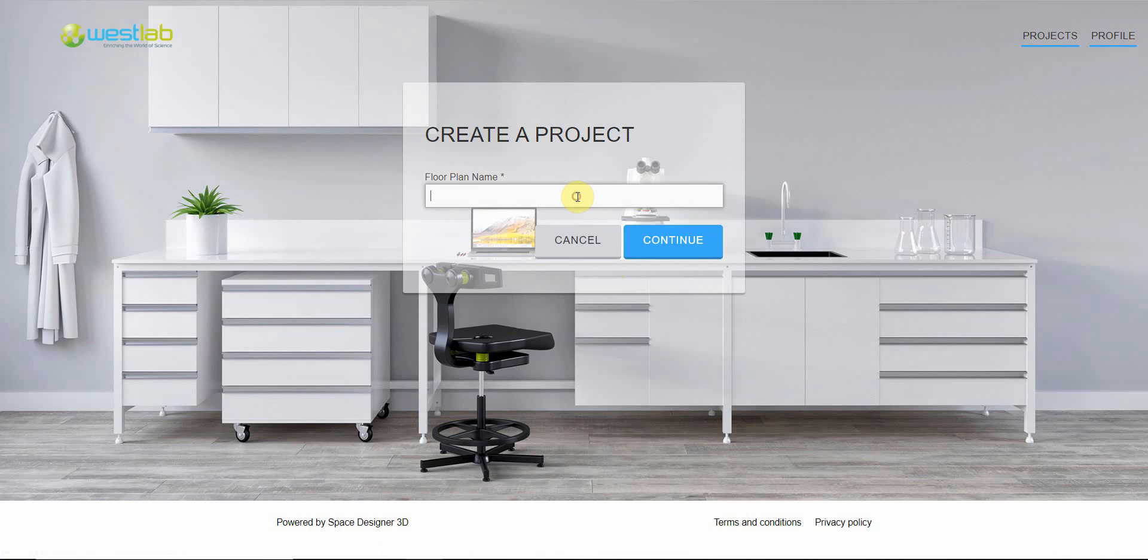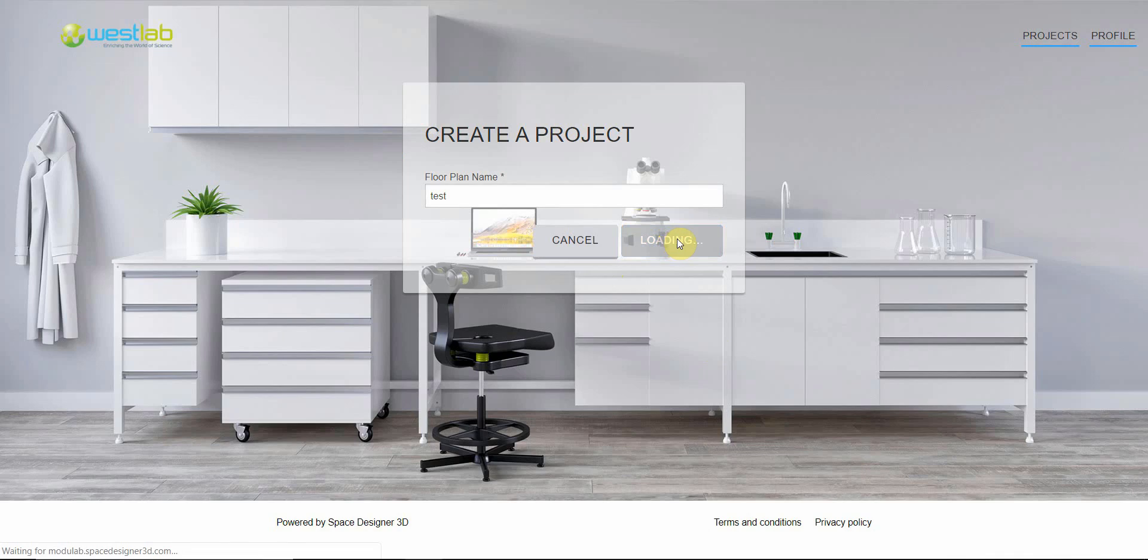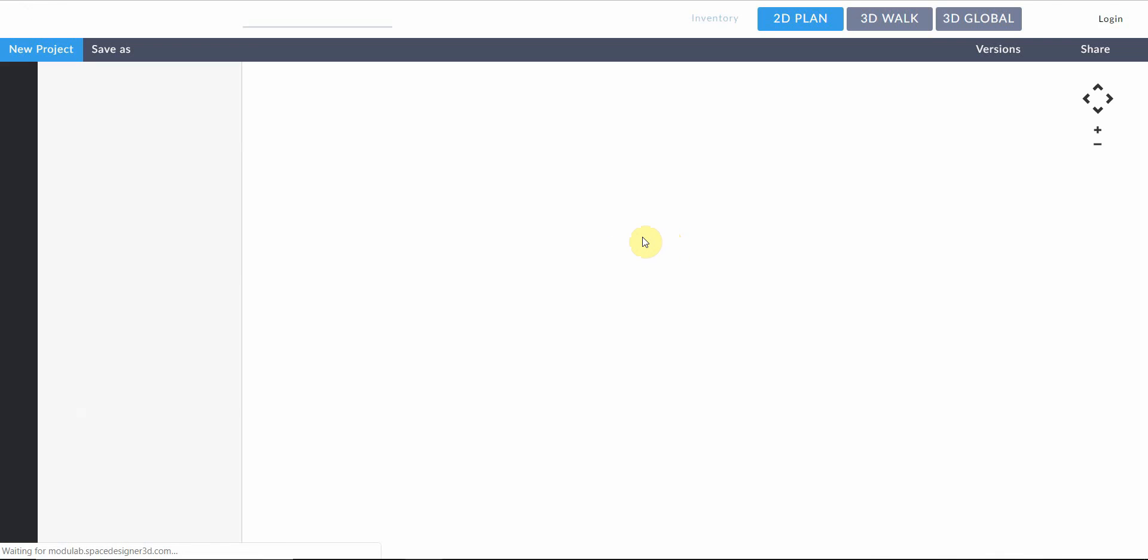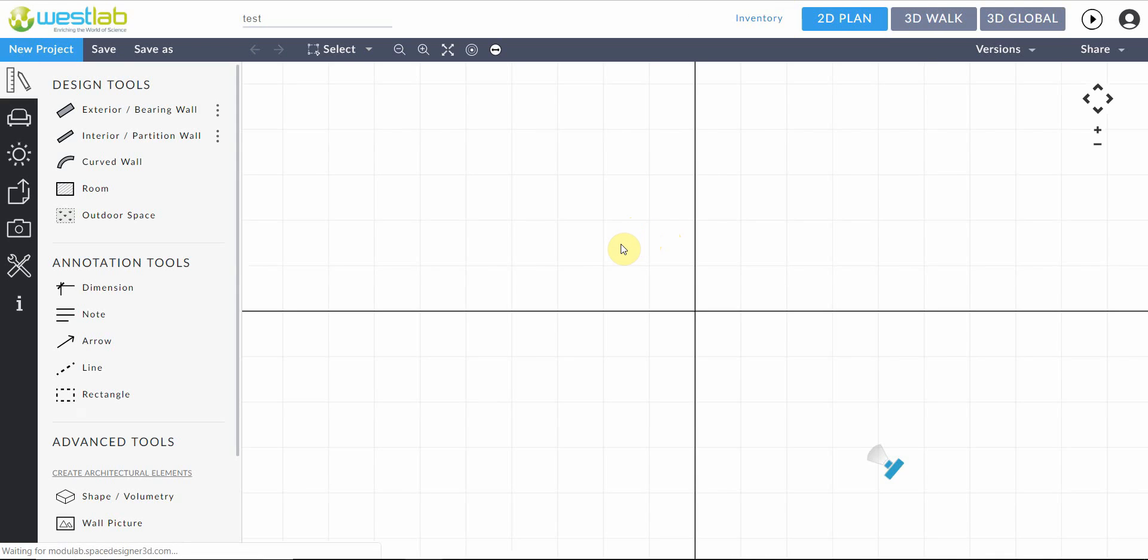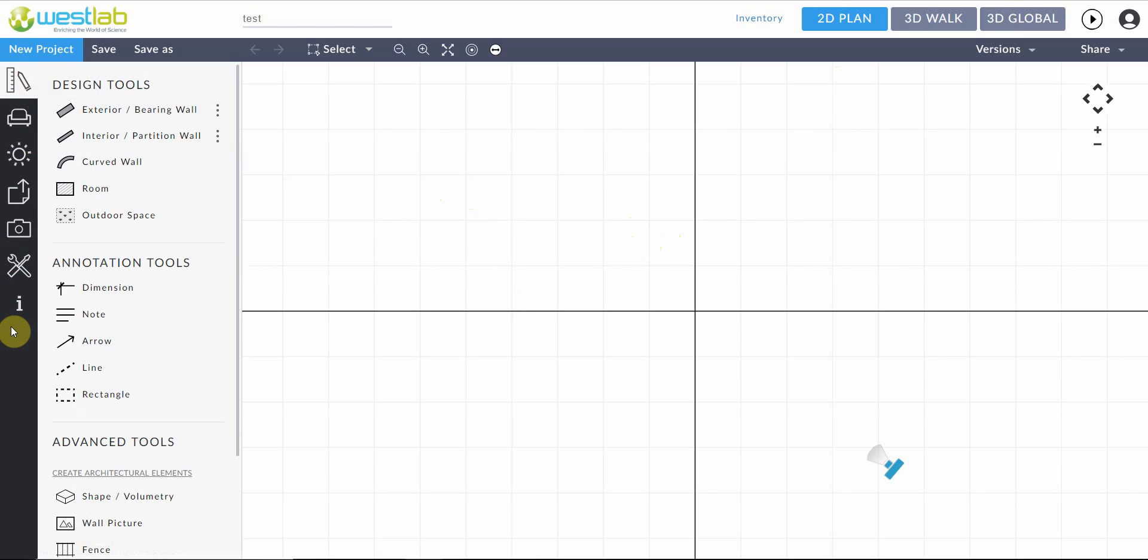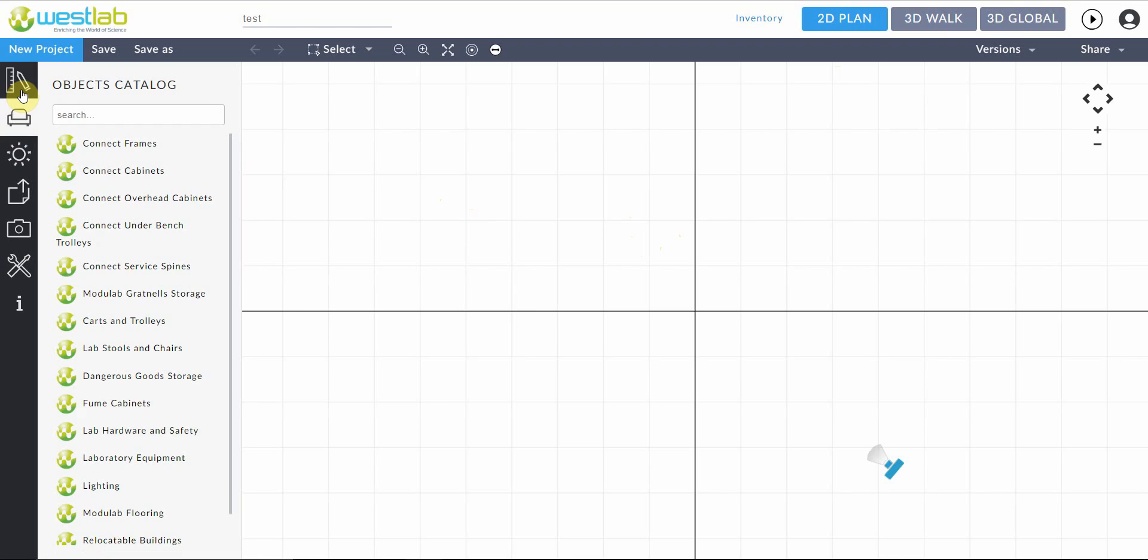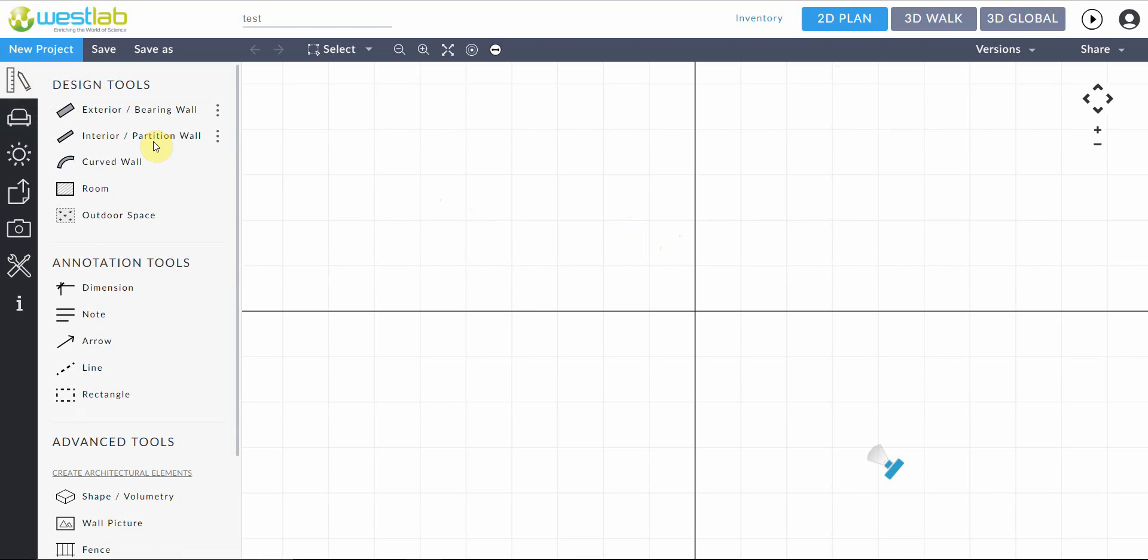Here we can name our laboratory space. This now takes us through to the drawing page. So along the left we have seven tabs. We're just going to focus on the first two in this video.